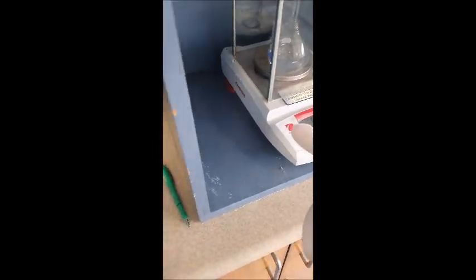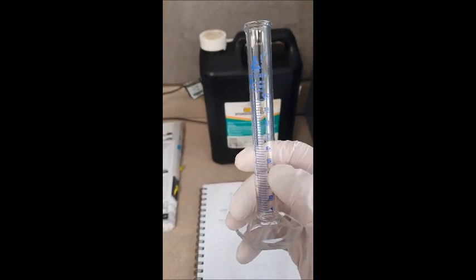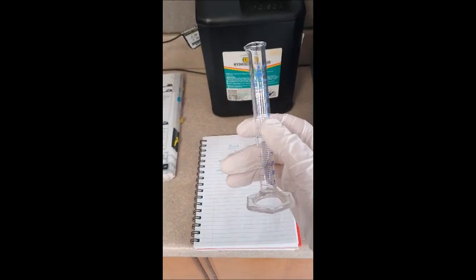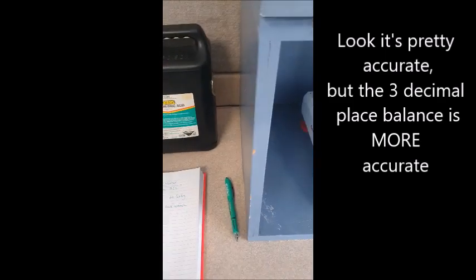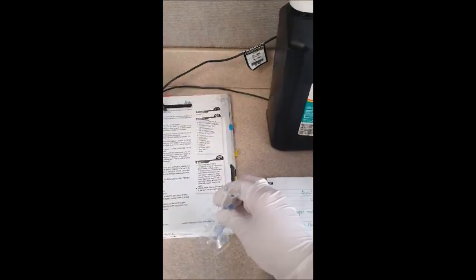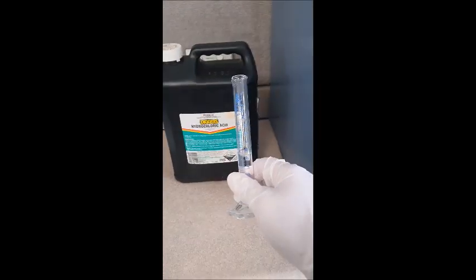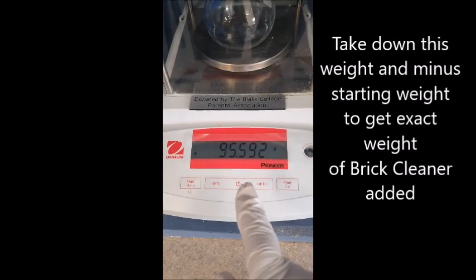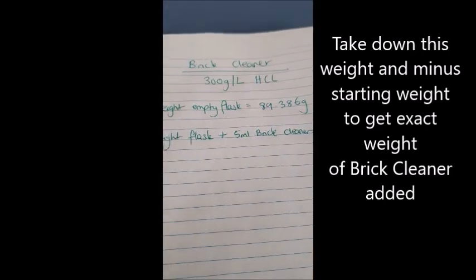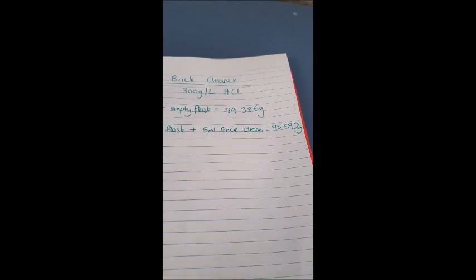Then I need to put about 5 ml of this into there. But we're going to use the weight to accurately determine how much it is because this is like B grade glassware so even though it says 5 ml it's not super accurate. It's plus or minus 0.2 ml. So we need to be more accurate than that. So we're going to use the weight to accurately weigh it. So the 5 ml is in there and our new weight is 95.592. So we've got the weight of the flask and then the weight of the flask plus the brick cleaner. So now you can figure out what is the weight of the actual liquid that we added.